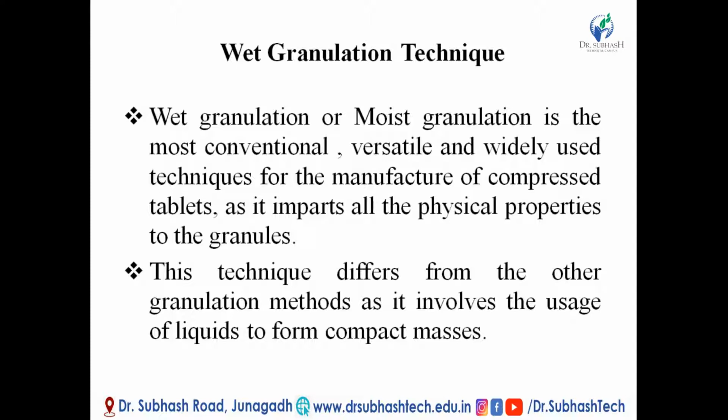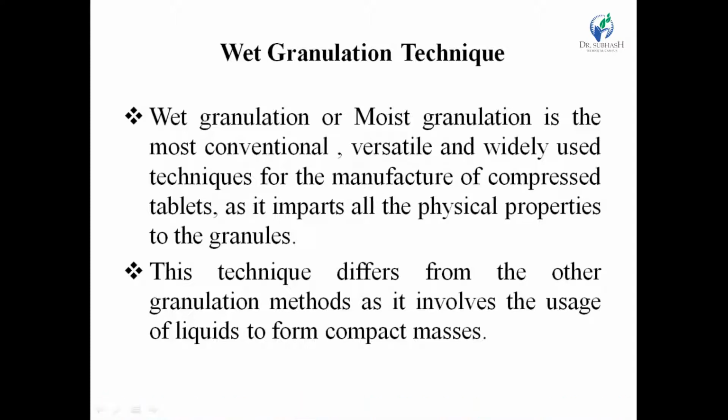This technique differs from other granulation methods as it involves the usage of liquid to form a compact mass. That means the wet granulation technique is different from the dry granulation method and the direct compression method because in this technique we use liquid to form a compact mass.